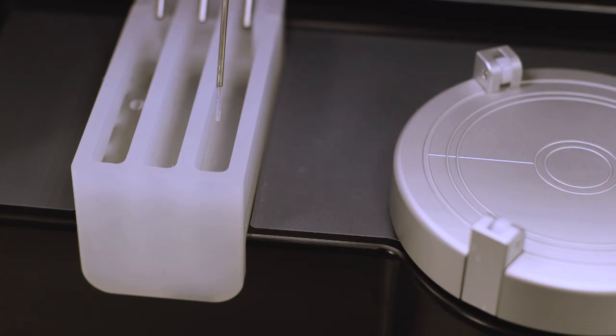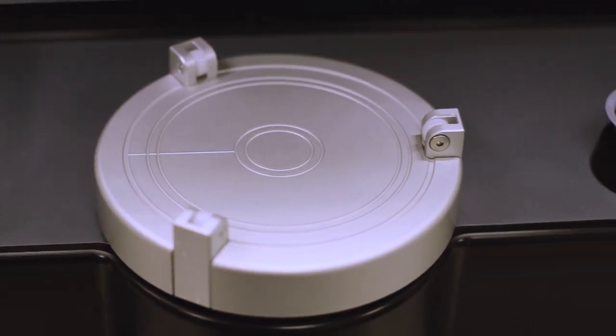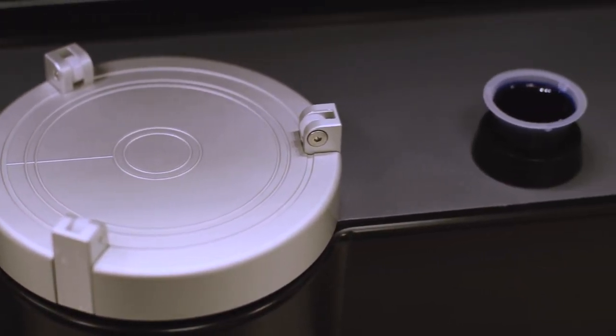As well as touchscreen control, flow detection technology and easy sanitization, Wasp Touch can be enhanced with a range of optional extras.